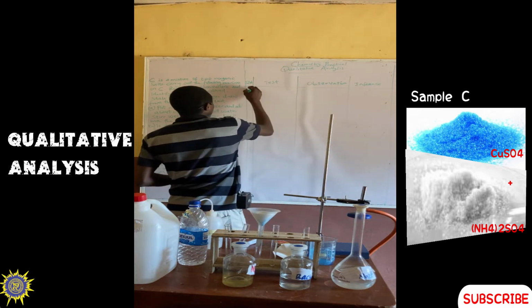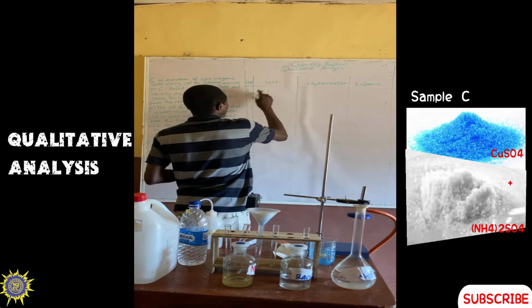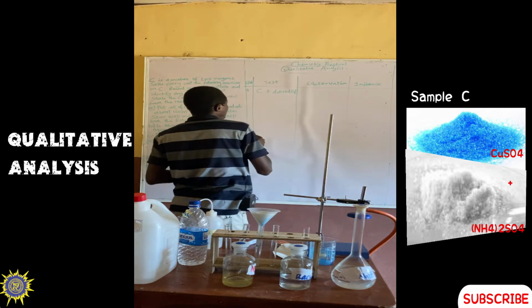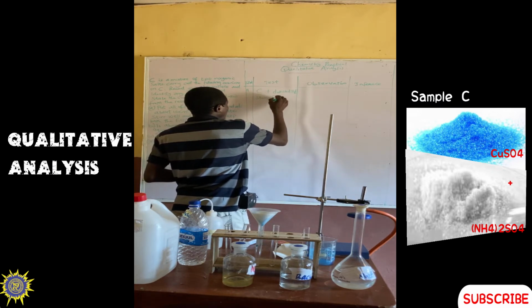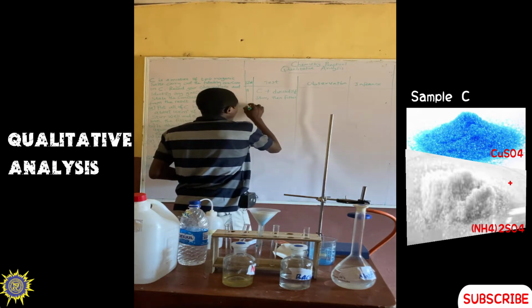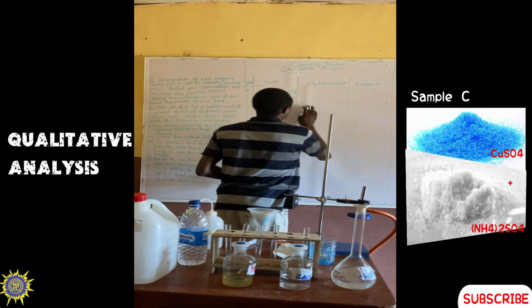Now, the first thing which we will have to do is to add water to C. So C plus distilled water. You can abbreviate the water with H2O. So represent it with H2O. Then stir, then filter. So what do we have? The filtration is yet to be completed. So let's use the opportunity to fill the rest.